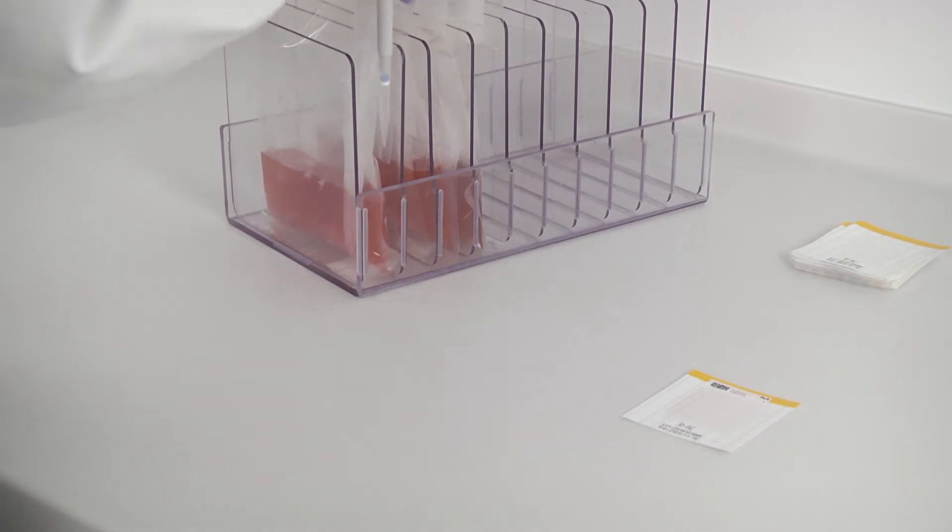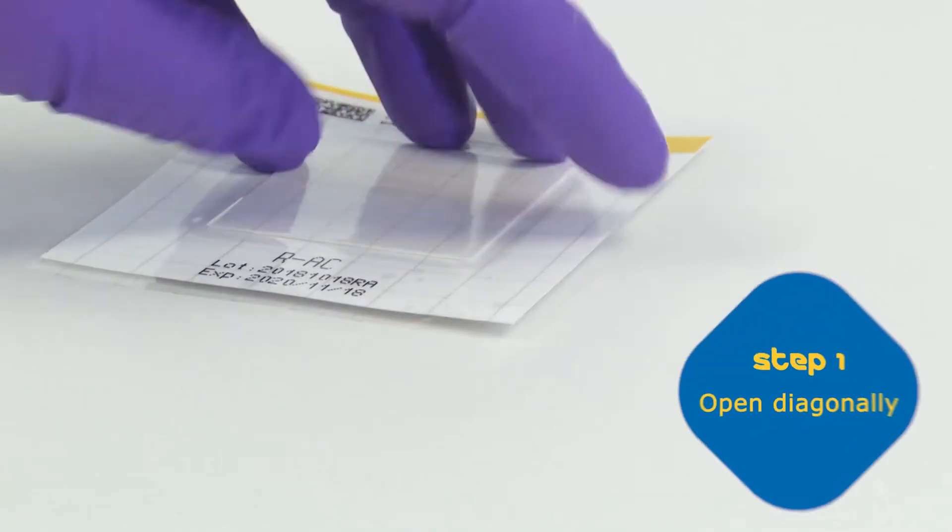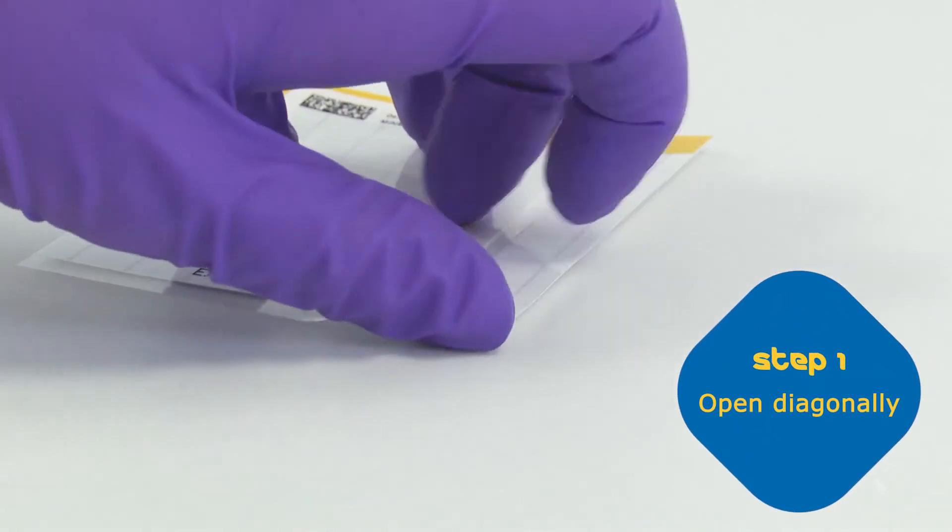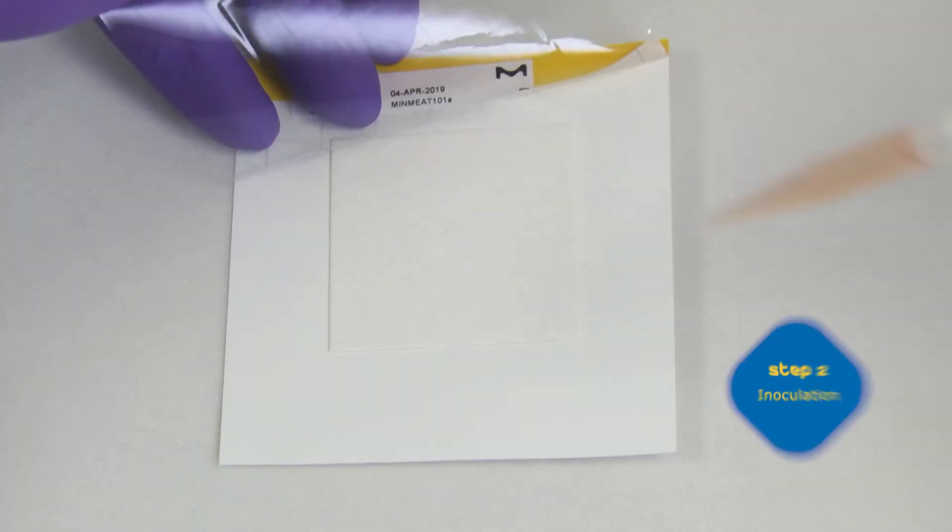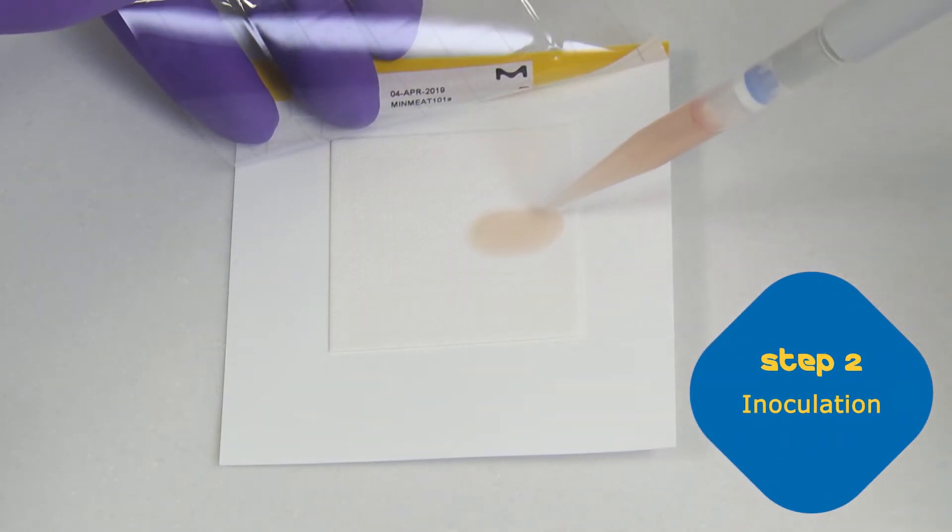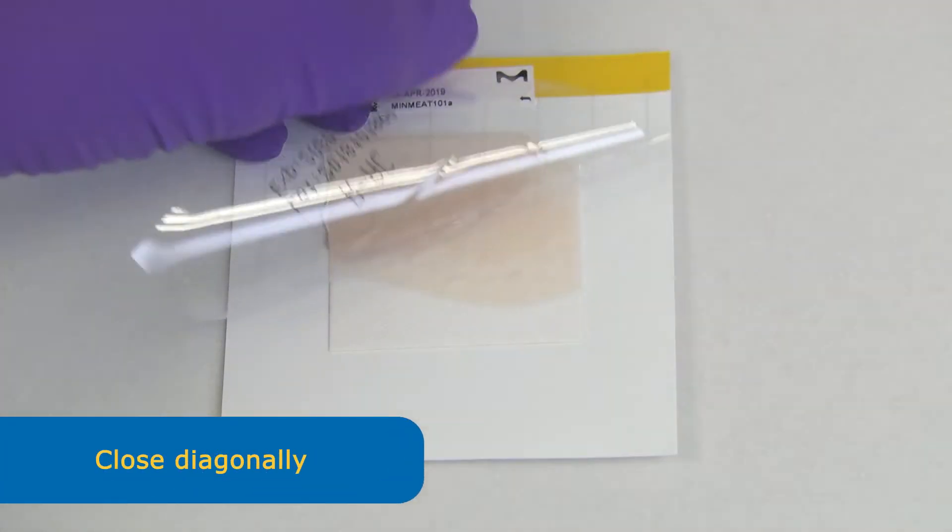With every MC MediaPad, 1 ml of sample can be tested. To ensure proper closure, open the lid diagonally before applying the sample. Apply the sample to the middle of the pad. It will automatically distribute. Close the lid diagonally.